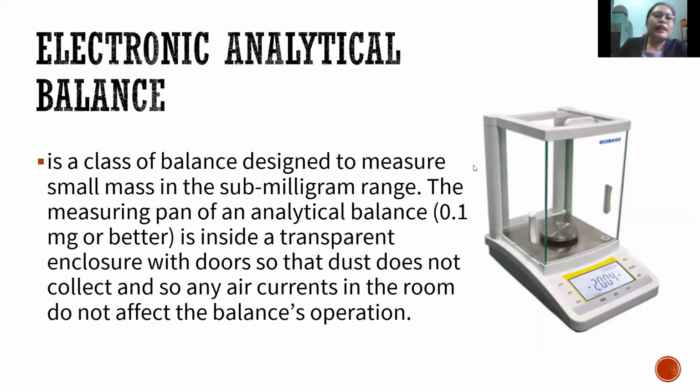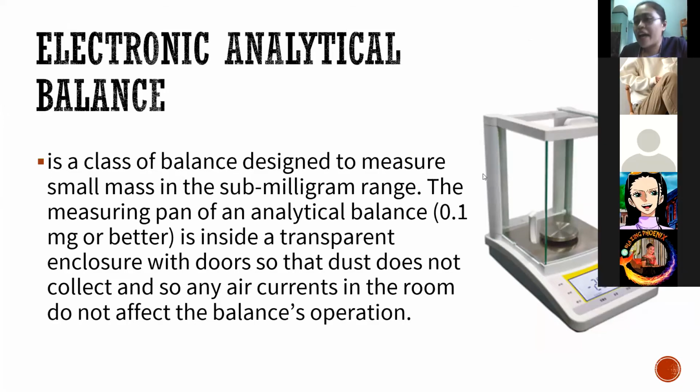However, let's make our lives easier. We'll have the electronic analytical balance. So ang ginagamit na nato karon mauna ni siya. Na diretso lang, kay itong life. We will just place the sample in the pan and then it just reads after.